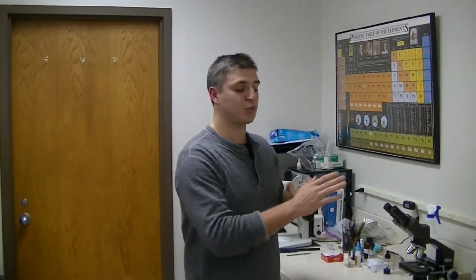So at this point, we've waited a couple of days. This is a plate that I made with a fusarium media and some root material that I isolated from a clover species. What we're going to do is put it on the light microscope, and we're going to look for 2 main things.